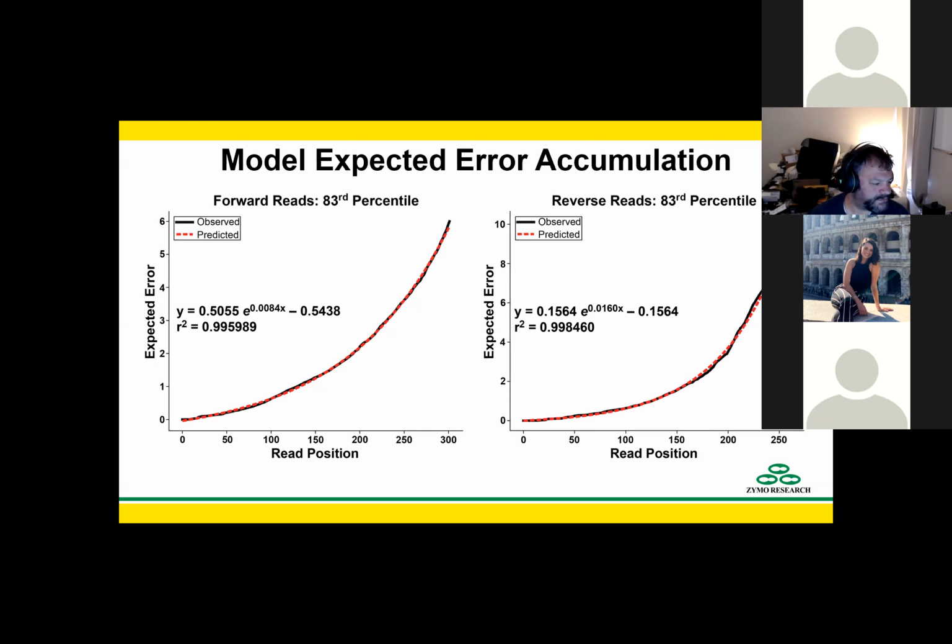All right, and I have a question from Sarah. Sorry to interrupt and go back to the DADA2 installation, but I'm getting errors. I've gotten that for a ton of packages, like RCurl, GenomeInfoDb, GenomicRanges. So I've gotten a ton of those non-zero exit statuses. Oh, okay.